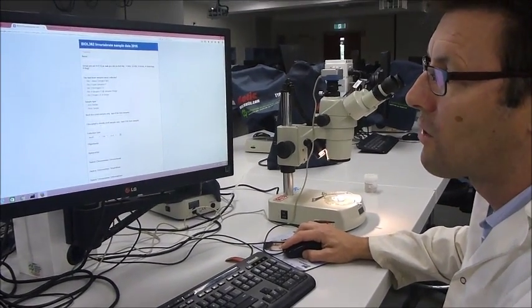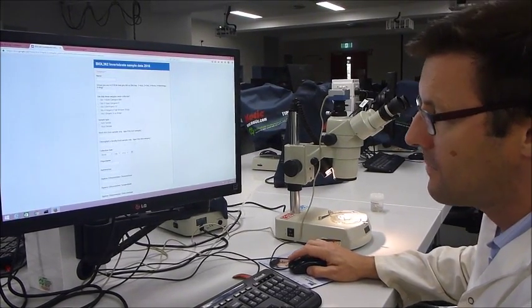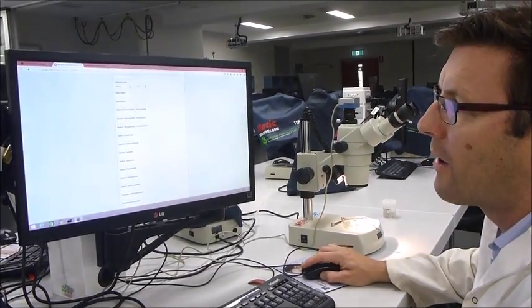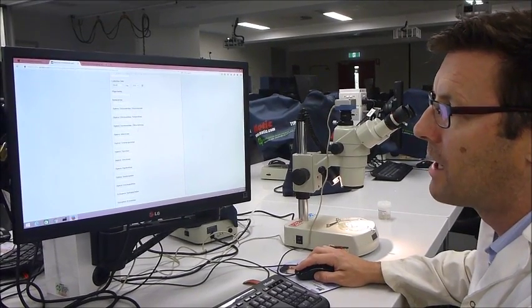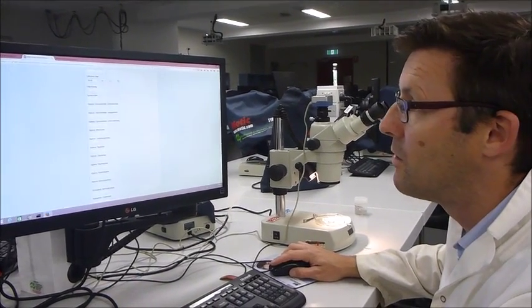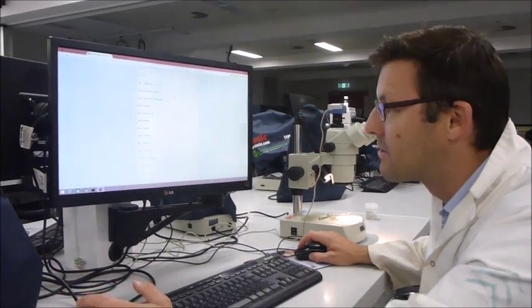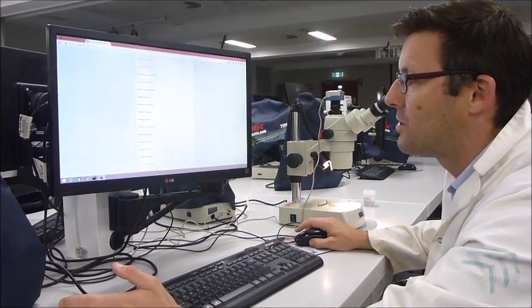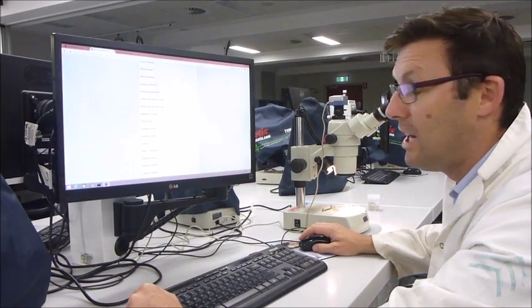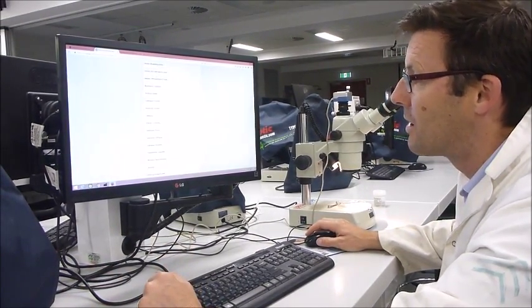And you also need to enter your chlorophyll A density that you calculated from the spectrophotometer readings. You need to enter the collection date, and then listed below are each of the common bug groups you might find. And so you can simply enter there the number of those particular animals that you have found. If you find a bug that is not on this list, please check with one of the tutors because this is most of the common bugs, and you may have found either a new species or something that doesn't occur here, in which case you might need to re-identify your animal.